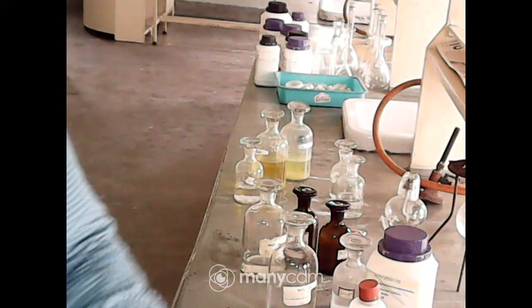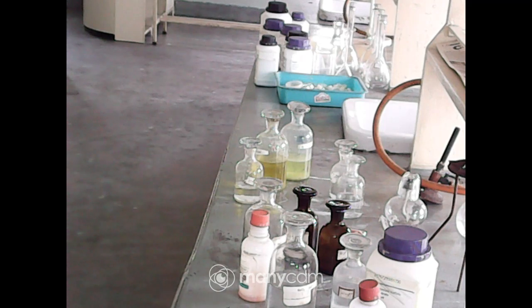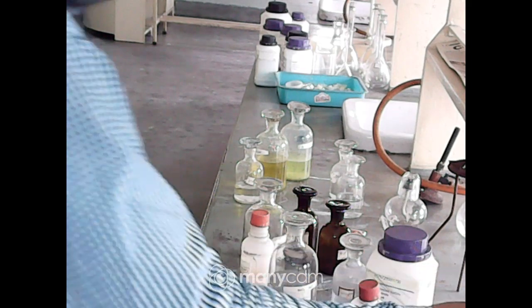Now add Nessler reagent. Okay, you can see that brown PPT. The brown PPT confirms that ammonia is present. It is a complex formed by the Nessler reagent with that ammonia. All these you will find in your inorganic portion in group 15. The reactions of ammonia, that type of test with Nessler reagent etc., you will find there. So already we have confirmed one such cation, that is ammonium.